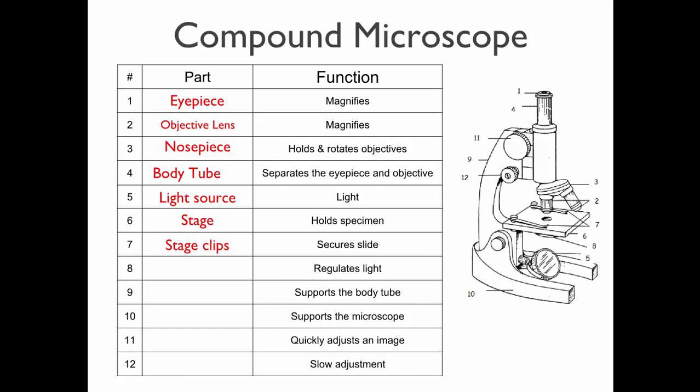This microscope has these little knobs here. And what they do is they move the stage forward and backward. They move the slide left and right. So you can get very precise control over how the slide's moving. So it's a little bit different type of microscope.